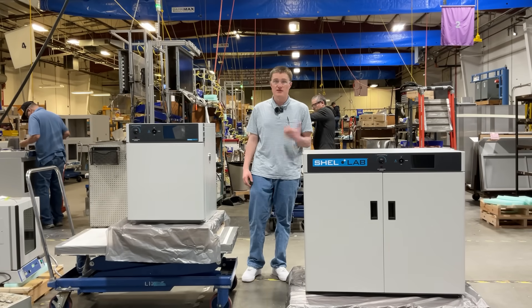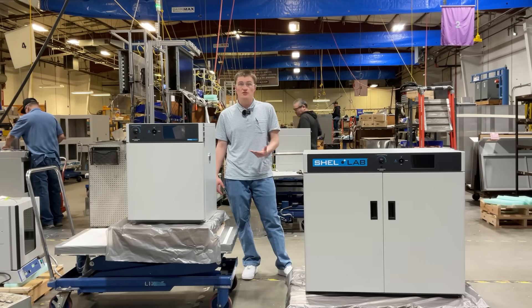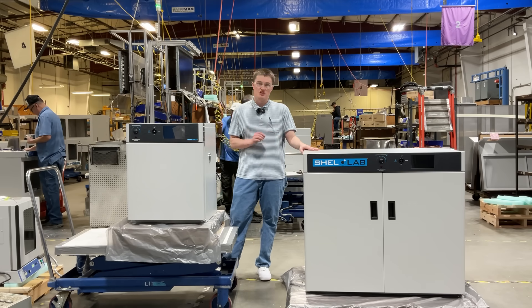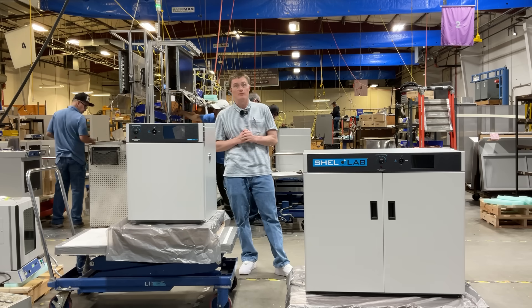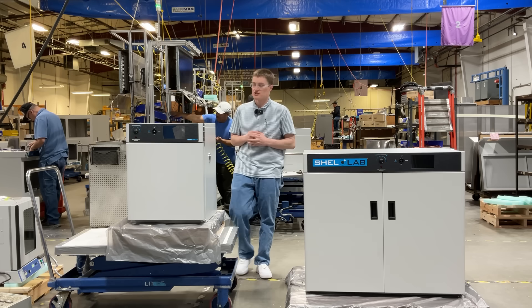Hello, my name is Kord Sanksteek. I'm a design engineer here at Sheldon Manufacturing, and today we're going to be introducing the SMI-2 and SMI-11 Microbiological Incubators. These products are a trusted solution for precise temperature control in microbiology, research, and pharmaceutical applications.